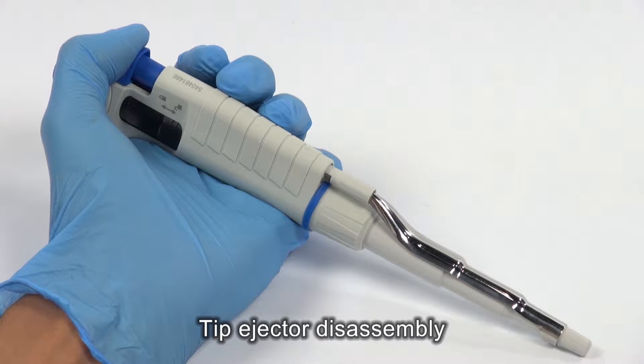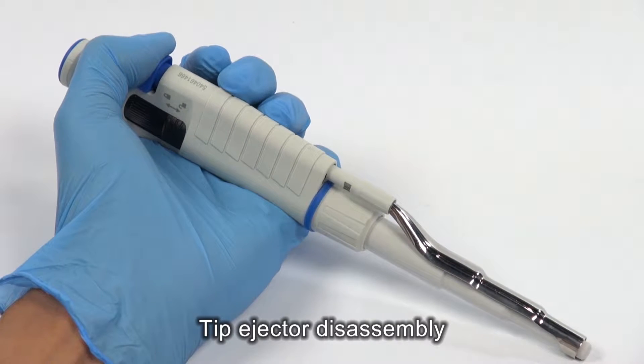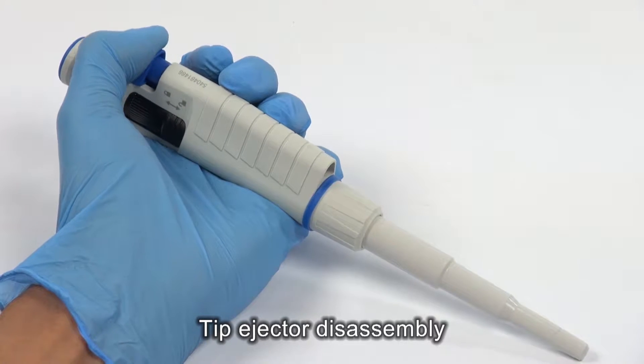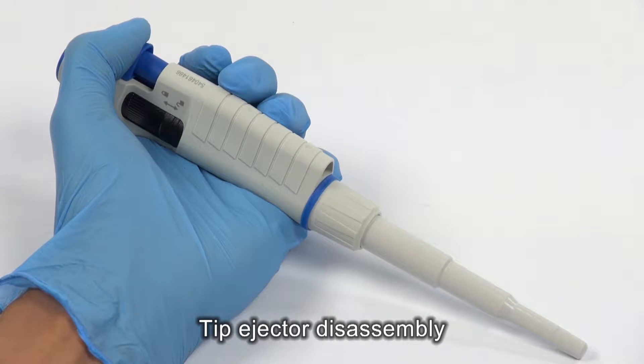To remove the tip ejector, press the tip ejector button, turn the ejector bush to the left, and slide the ejector from the arbor.